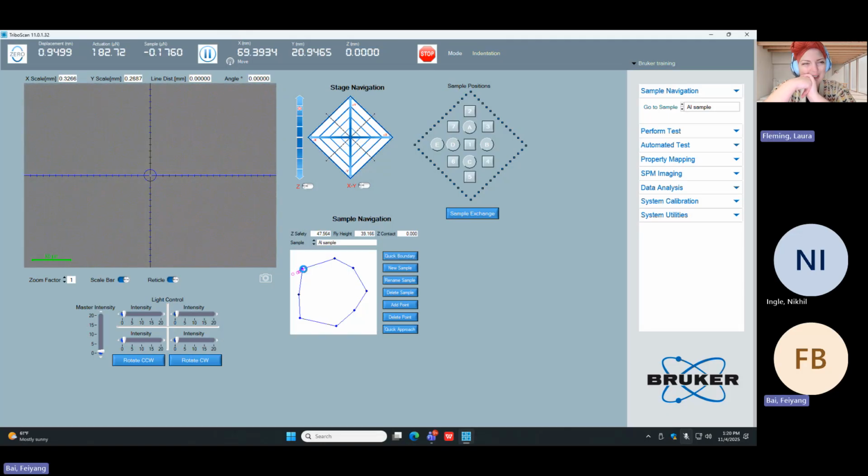Hello, welcome. We've already updated the software, and we are currently just running through our 5 steps. We got through 4, well, kind of got through 4 yesterday. Right now we did our hardware is loaded, we did our indentation axis calibration, and now we're checking our predefined sample zones, the ones that we defined yesterday, because there's always a risk when you update software that the sample zone has been corrupted or changed somehow. So we're just going to verify that they are where they're supposed to be.